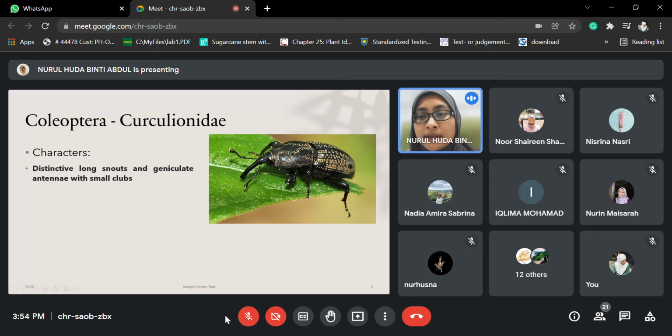That's why kamu nampak yang putih-putih ni actually dia adalah macam dust ataupun debu atau debris terlekat dalam that kind of surface. Maksudnya kan dia berlekuk kan, so terlekatlah this debris ni, so nampaklah yang putih-putih. So it's actually dia punya body is punctured. There's another word which is apa tadi saya sebut kan, I forgot dah. But you can say it's punctured.